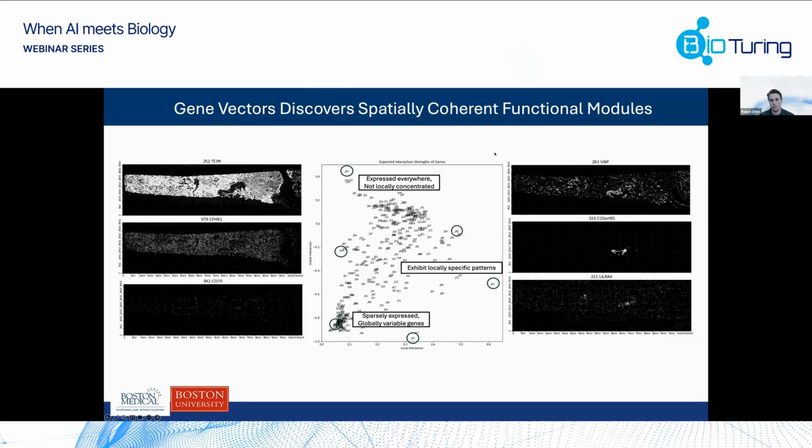Again, with 3D data, for example, the alignment is sometimes a tricky issue. We have our own 3D data sets, and we are trying to see what works best. There are some tools available, but they don't always work as well as the authors claim they do, which is true for almost any tools, right? It's not just that one. Yeah, the field is moving very fast, and there are a lot of new problems.